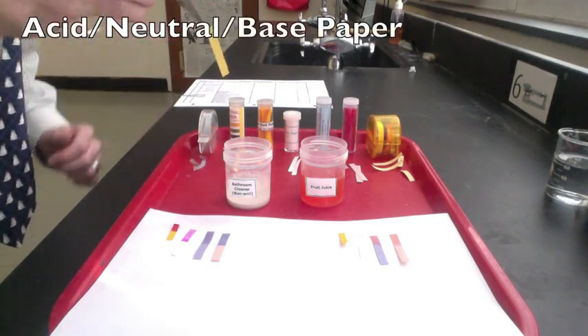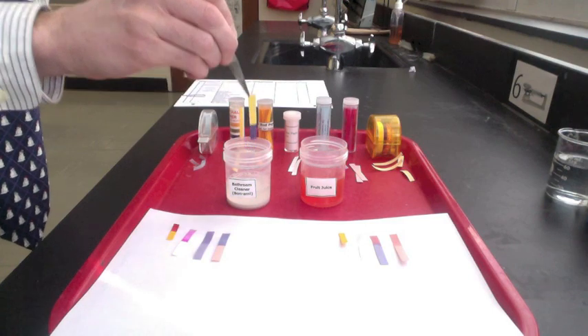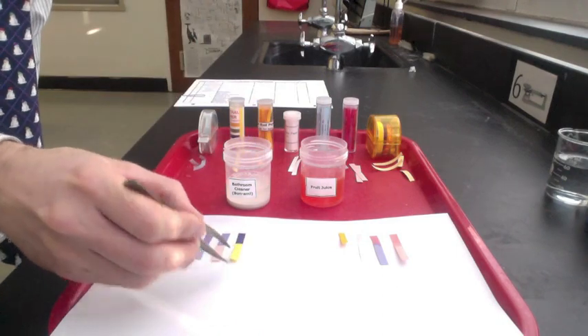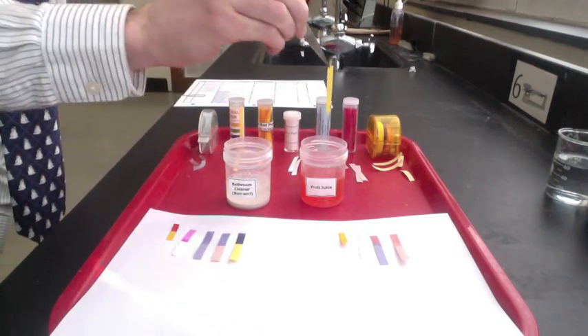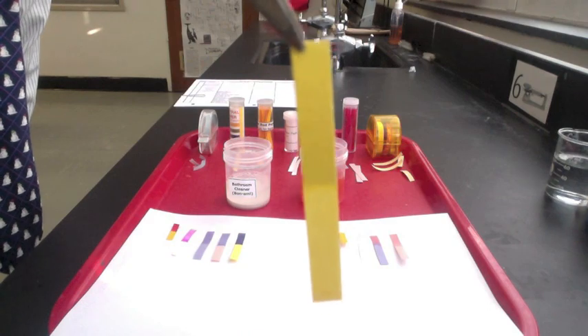Another indicator is acid-neutral base paper. If it stays gold, it's acidic. If it turns green, it's neutral. If it turns blue, it's a base. When dipped in the cleaner, the acid-neutral base paper turns purpley-blue. When dipped in the fruit juice, we can see that it remains a gold color.